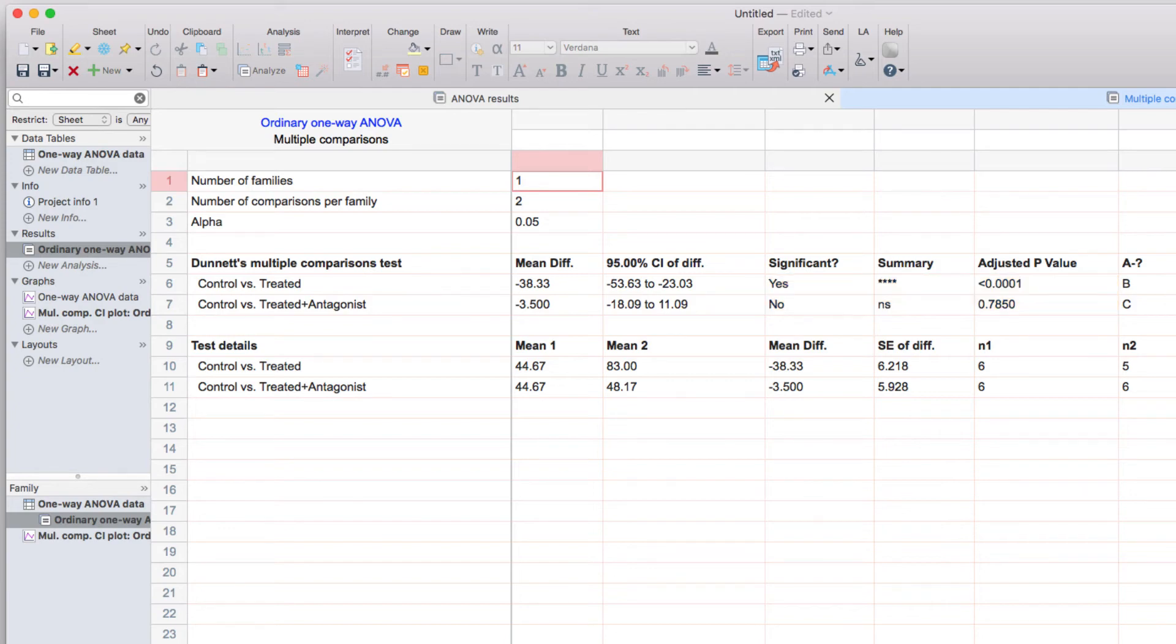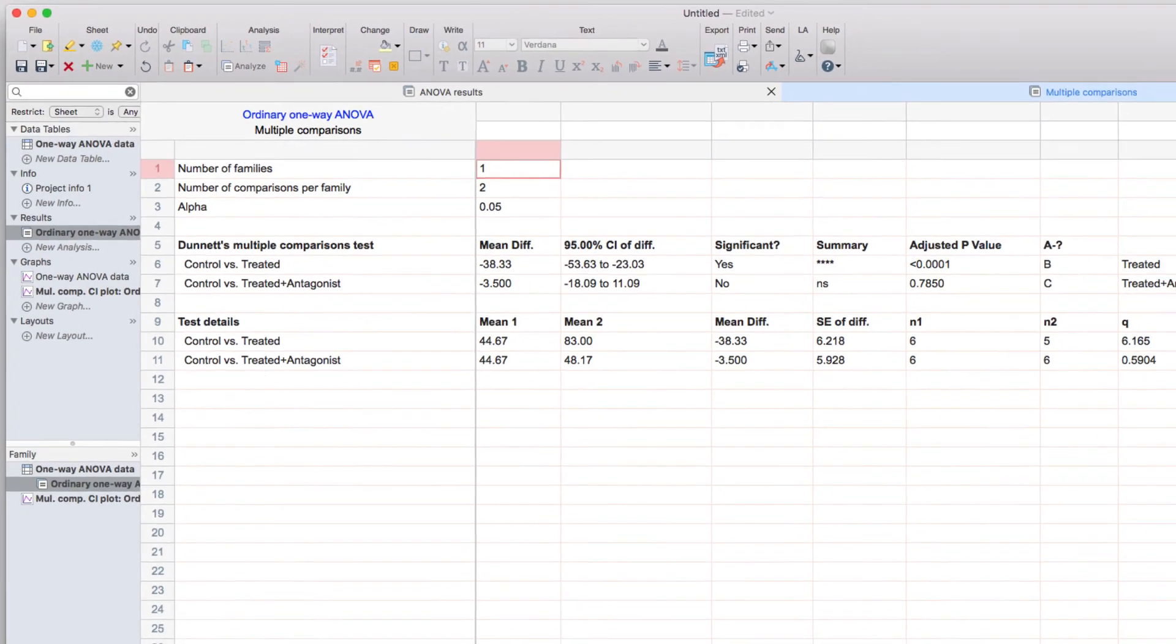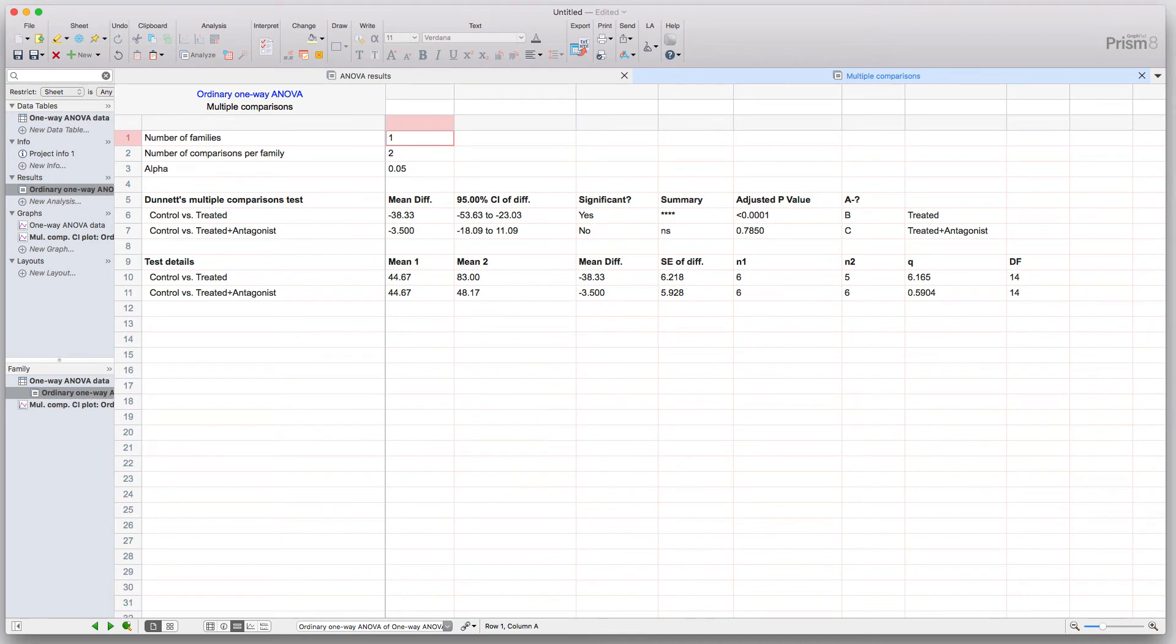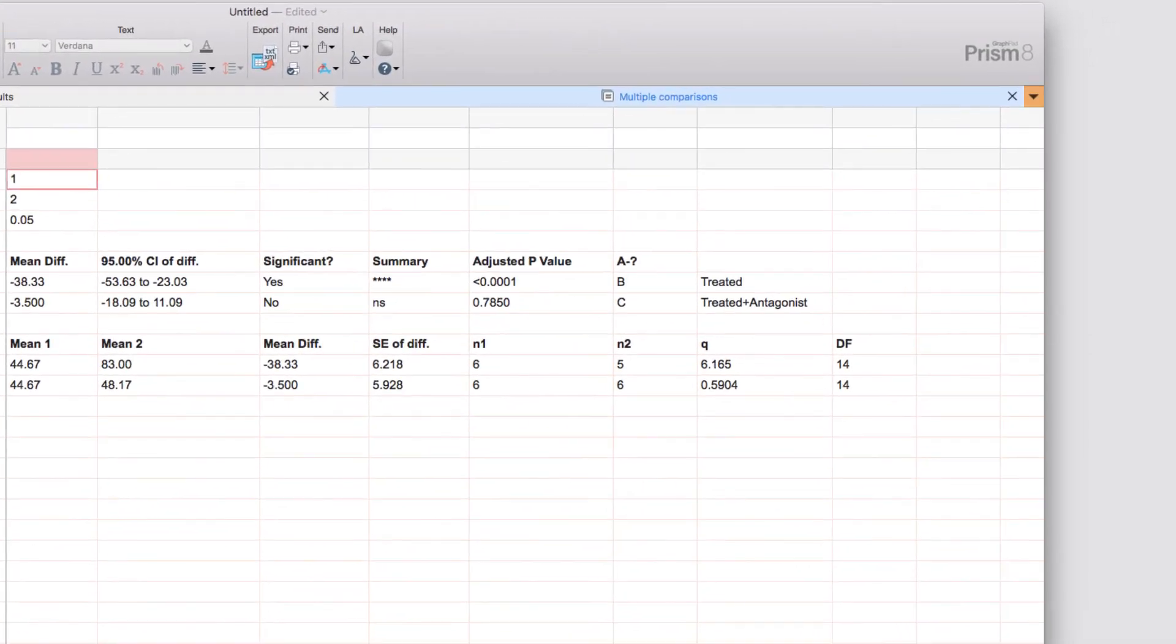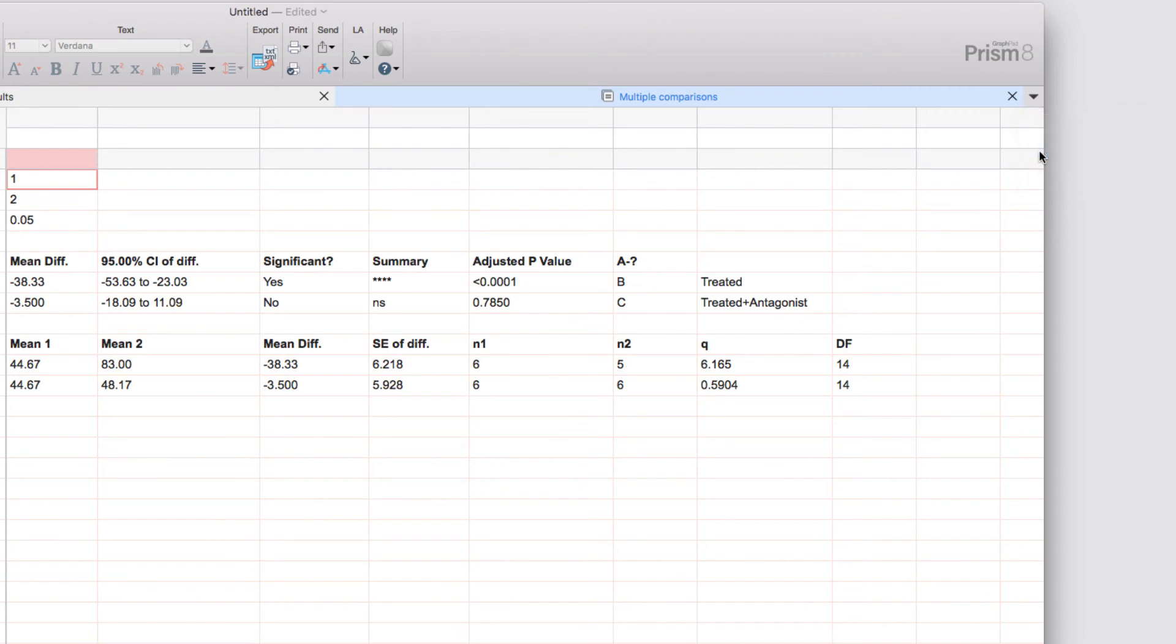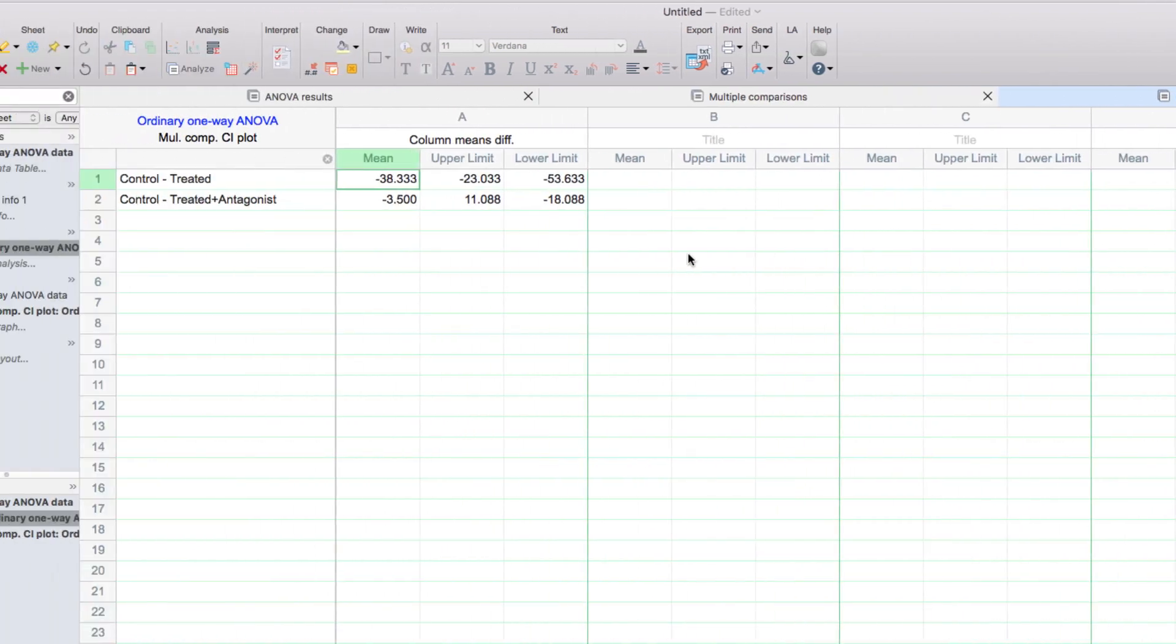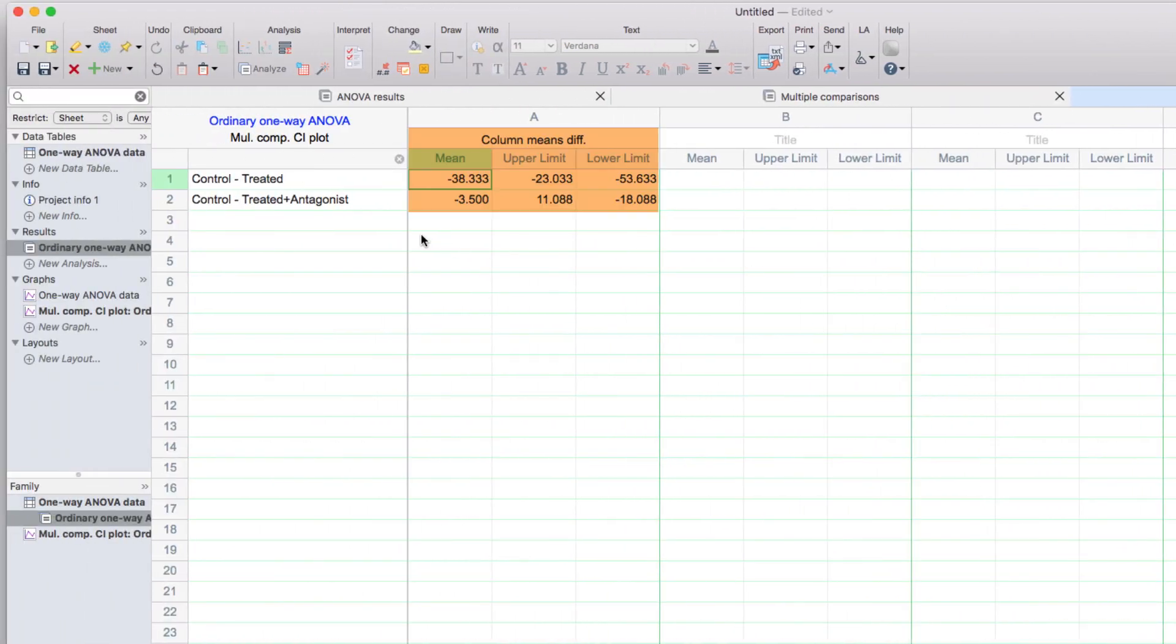What you may notice is that the data used to graph the confidence intervals are not shown, and that is true for any data results that are only used for graphing. They are hidden by default. However, by clicking the drop-down arrow, you can select to show that tab, and you can see that this is the information used to create this graph here.